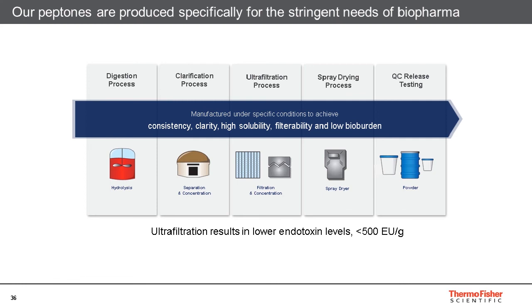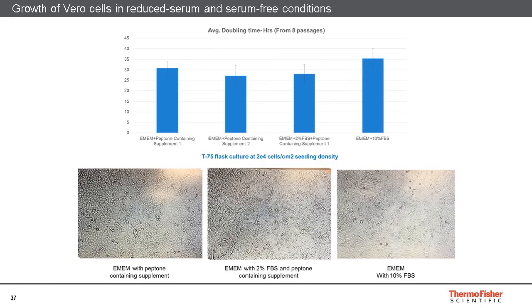To ensure consistency, we implement in-process control for each step highlighted on this slide. As example, for hydrolysis, a specific attention is put on temperature and pH control, as these are the critical parameters for the digestion process. For filtration, we control tightly our target percent solid, and we require each batch to achieve this target upon the first filtration. Otherwise, the whole batch is discarded.